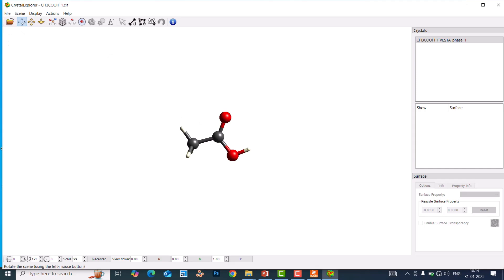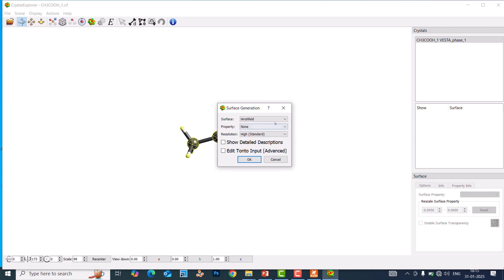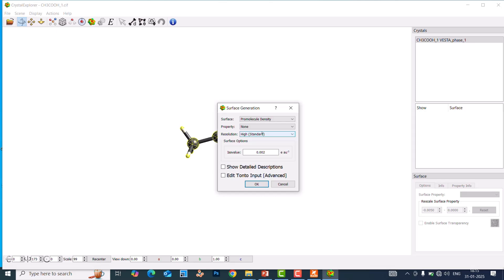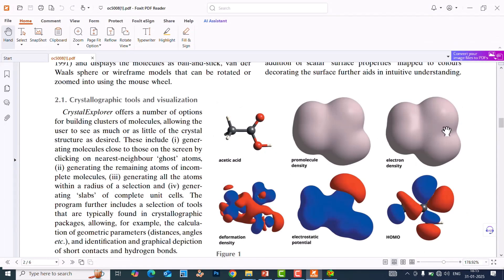To generate a surface, first double-click any atom of this molecule — it will select all atoms. Now we can make our surfaces. Click the first atom and then go to Generate Surfaces and click it. The dialog will appear. The first surface type is pro molecule density, as I showed in that paper. They made pro molecule density, electron density, deformation density, electrostatic potential, and more. I will show you how to make these five surfaces.